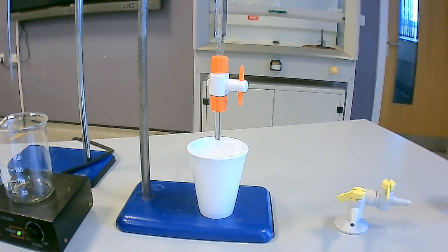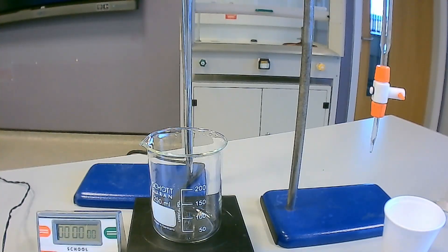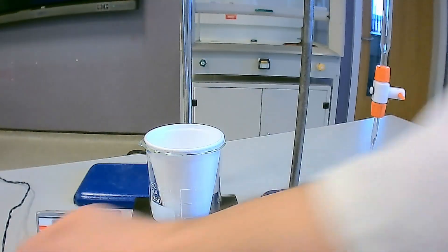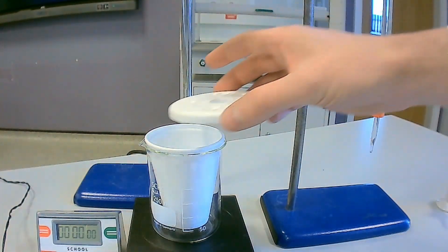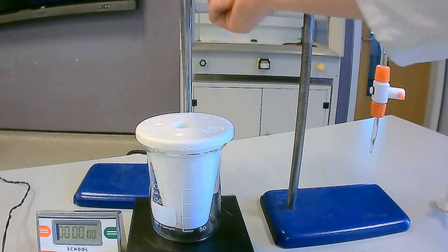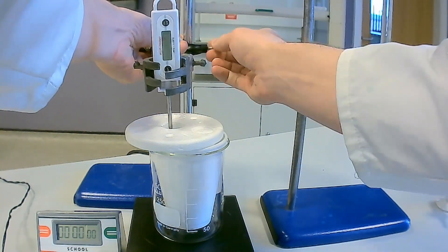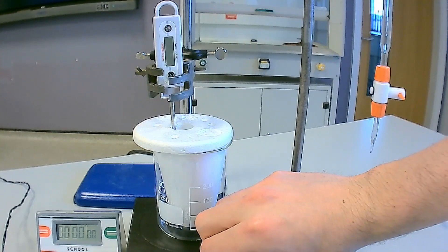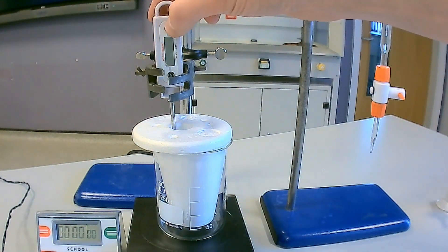Using a burette again, transfer 30 cm cubed of 2 mol hydrochloric acid into a clean polystyrene cup. Place the polystyrene cup containing the hydrochloric acid into a 250 cm cubed beaker. Add a magnetic stirrer bar into the polystyrene cup. Place the lid onto the polystyrene cup and place the thermometer into the acid to record the temperature. Again ensure the thermometer is not going to collide with the stirrer bar. Turn on the magnetic stirrer and begin a stop clock. Record the temperature at 0 seconds and then every minute for the first 3 minutes. Place these results in a suitable table.